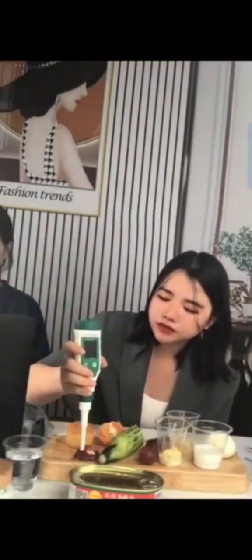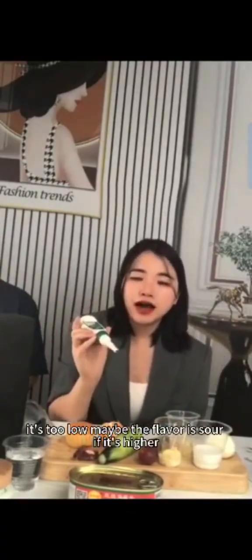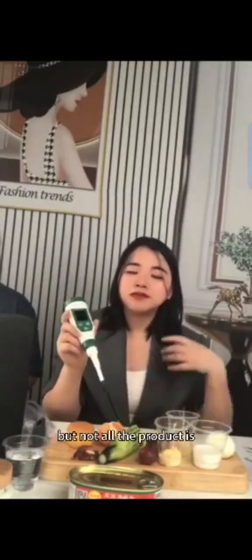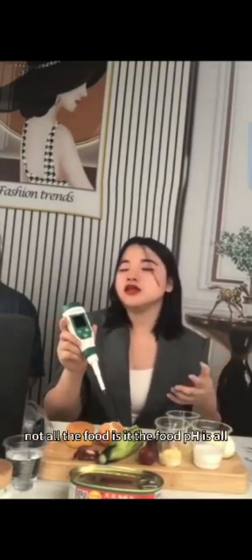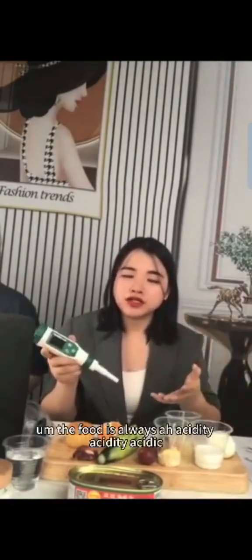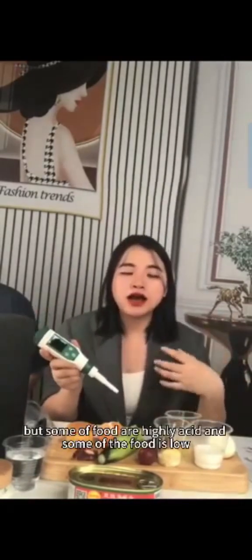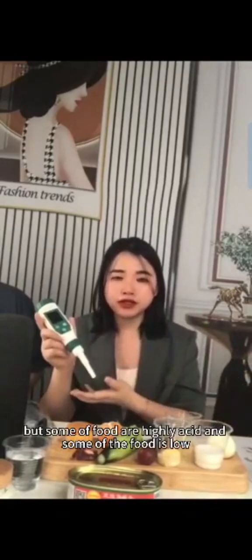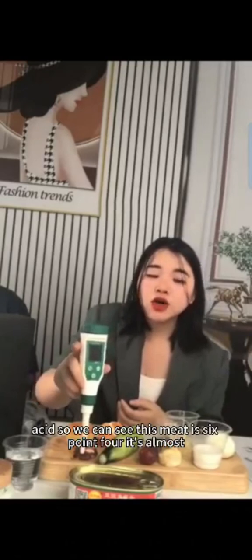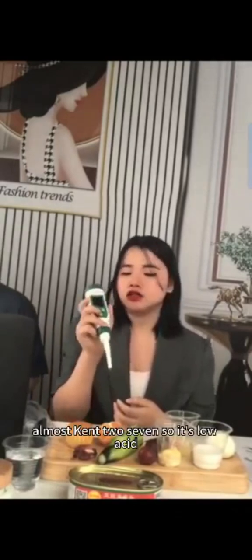If the pH is too low, the flavor may be sour; if it's higher it may become bitter and sweet. Not all food has the same acidity — some foods are highly acidic and some are low acid. This meat is 6.4, almost 7, so it is low acid.